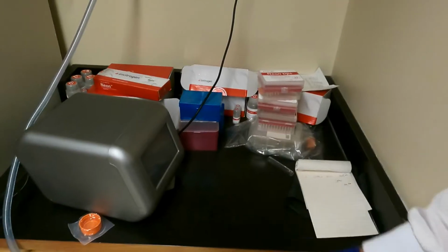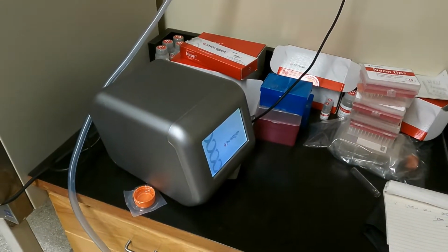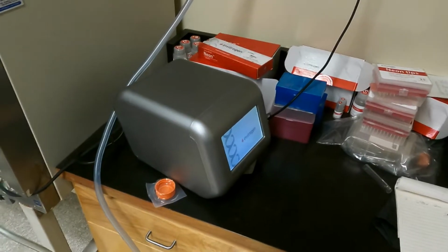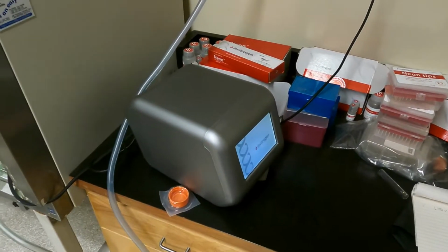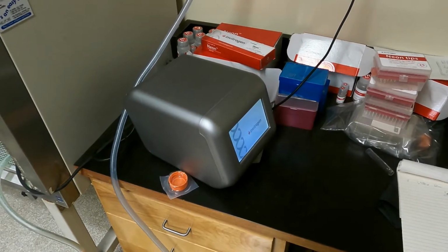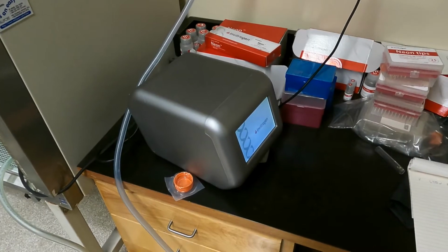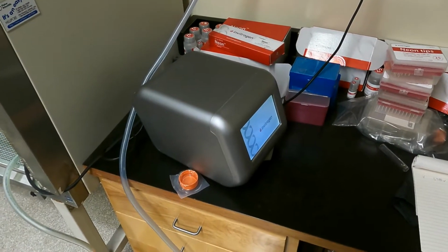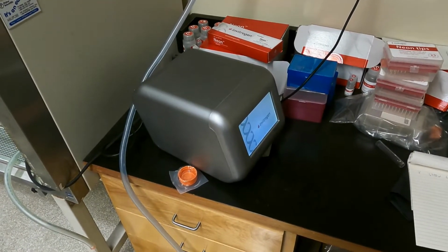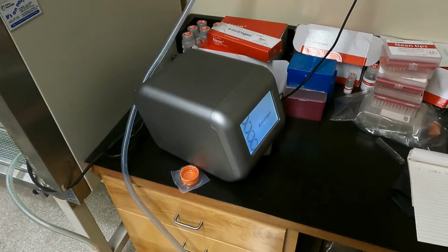And here you can see we've got to program it, and what we're going to do is give it 1650 volts for 20 milliseconds, and we're only going to do it once, okay? And then we're going to set up the electroporator and get a ring ready for the main event, which will be the electroporation. I'll show you how to do that. So we just wait for it to warm up.